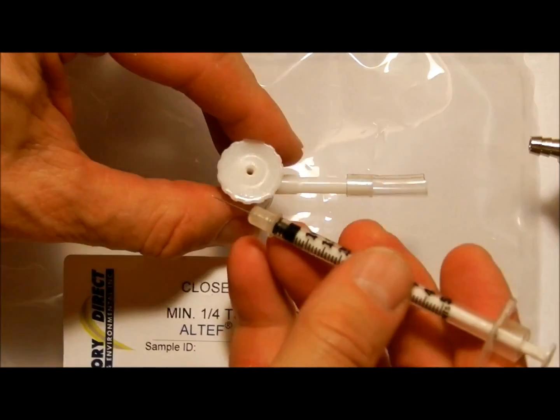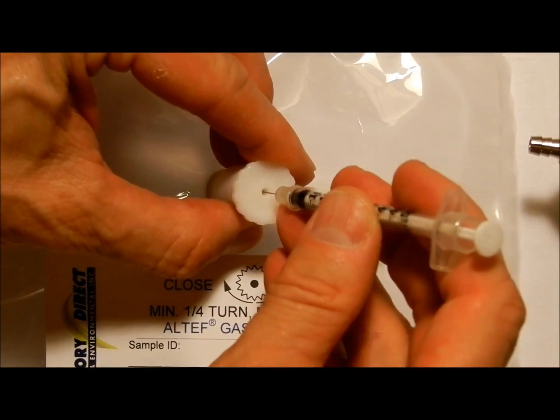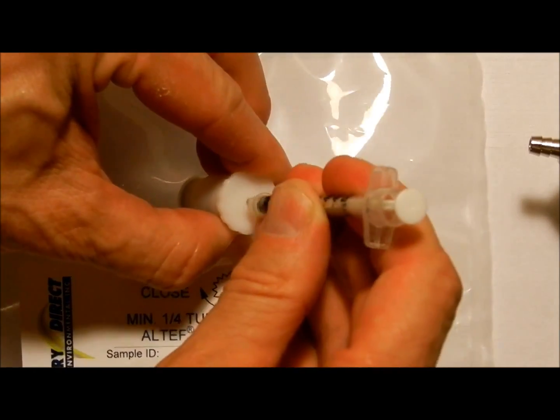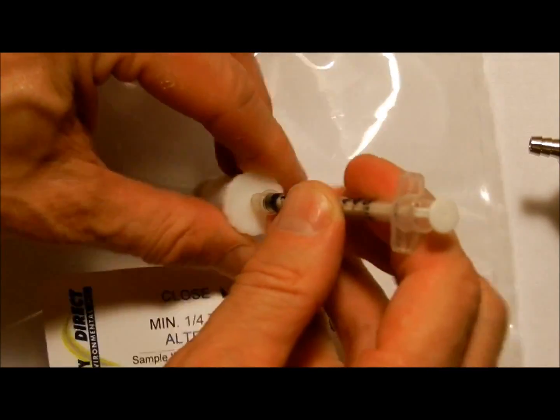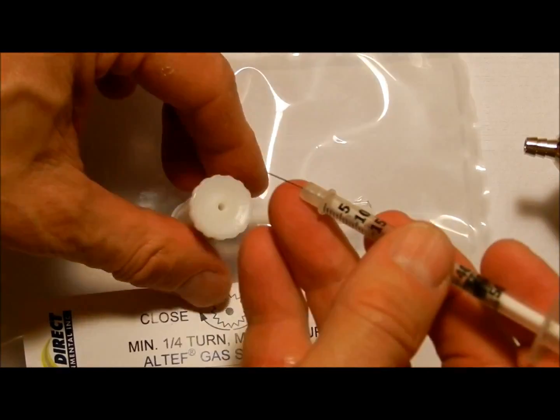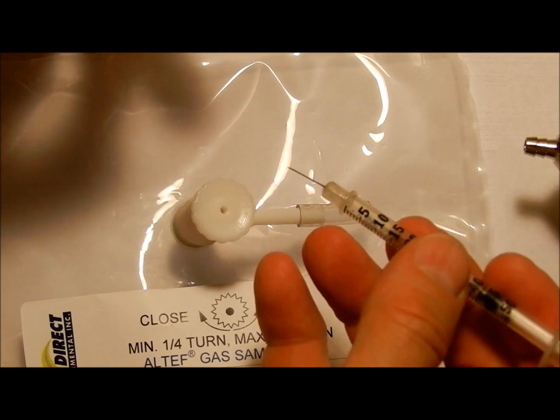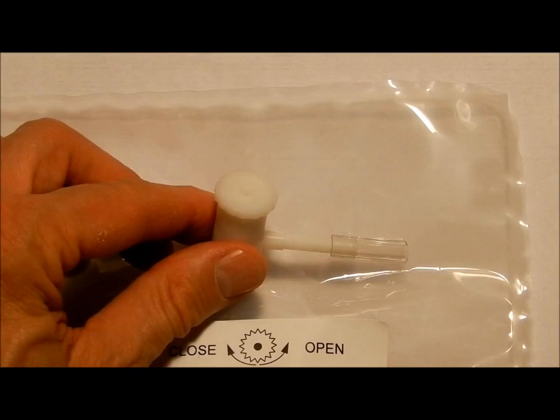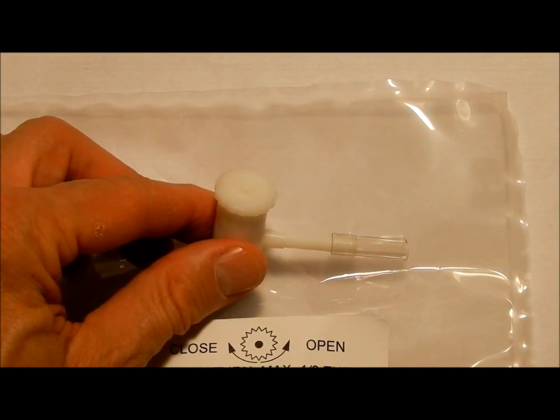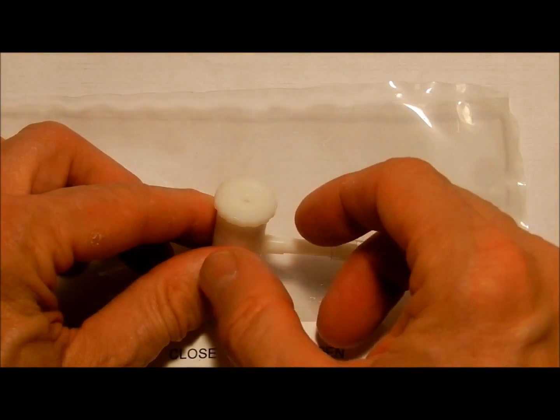If desired, the gas sample can be placed into the bag or removed from the bag by inserting a syringe through the septum. The syringe forms a tight seal without the need to open or close the valve. The septum can be used multiple times but eventually should be replaced to prevent leakage.